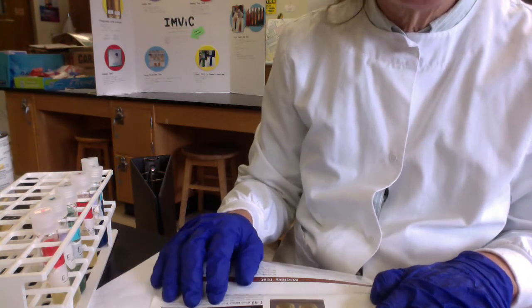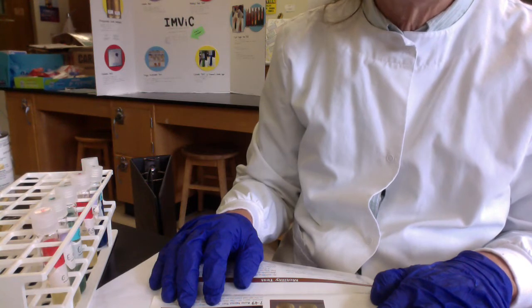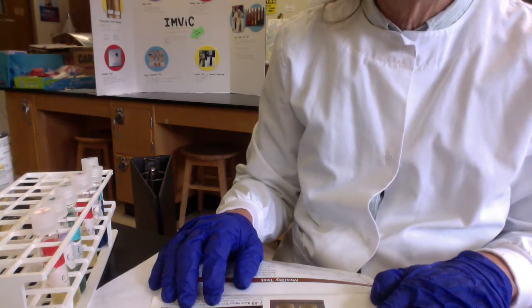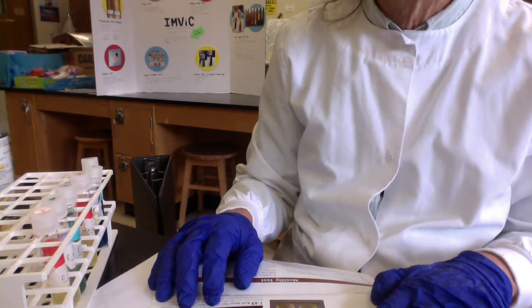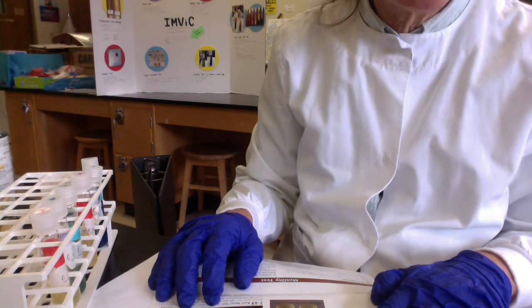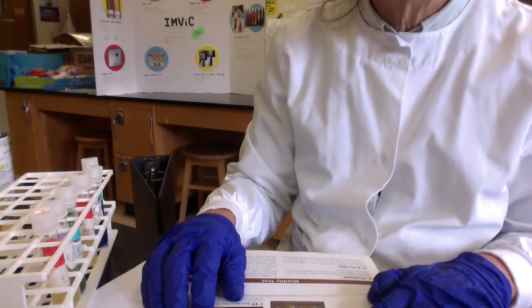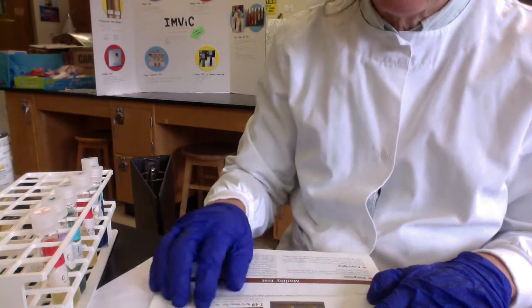So just really quickly, you guys, and you'll want to memorize this for the lab exam too. So the IMViC results for E. coli are positive, positive, negative, negative. Positive indol, positive methyl red, negative Proskauer's, negative citrate. And then for Enterobacter aerogenes, it's the opposite. So Enterobacter IMViC is negative, negative, positive, positive. Enterobacter is negative indol, negative methyl red, positive Proskauer's, and positive citrate.